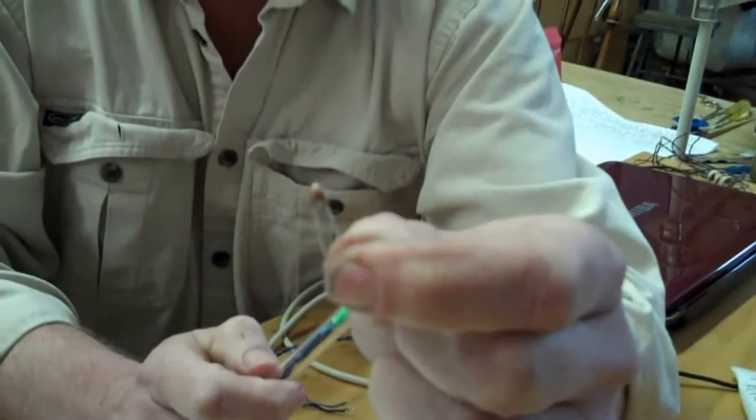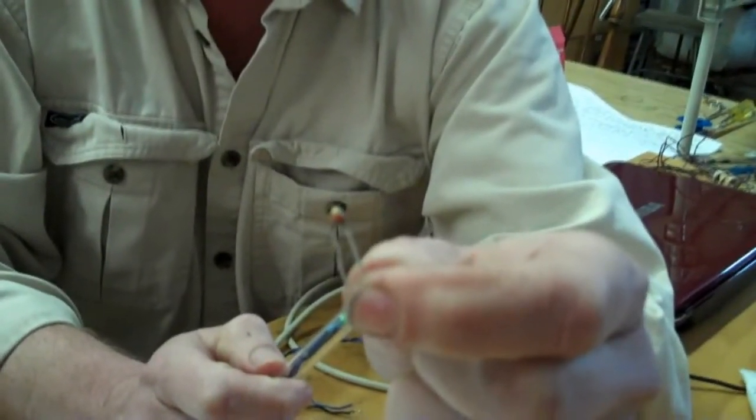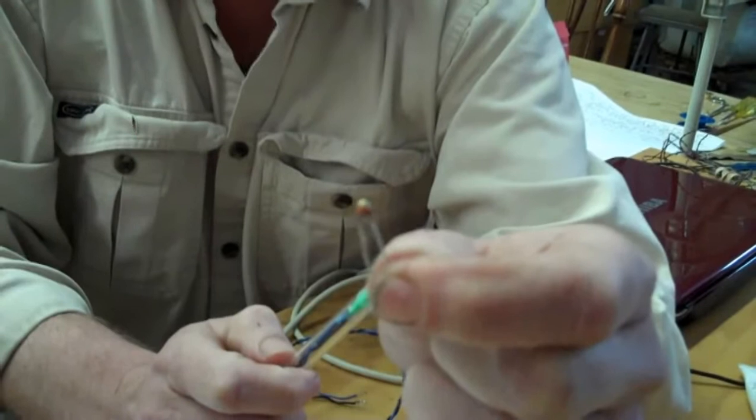Hi, I'm Charlie and I'm involved with some of the temperature measurements for the BioBoard. Specifically, here's a thermistor — a very inexpensive, probably on the order of 25 cents, temperature measurement device that comes in a wide variety of shapes and sizes, all the way down to the size of a grain of sand. It's just a resistor which has a very dependable dependence of resistance on temperature, so we can monitor the resistance and determine the temperature of our biological systems.